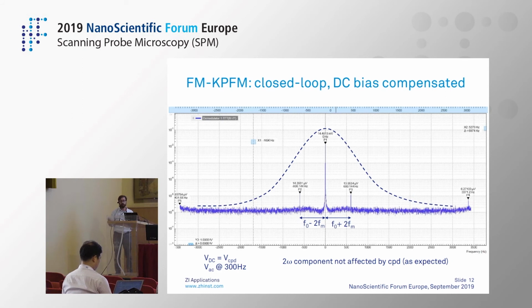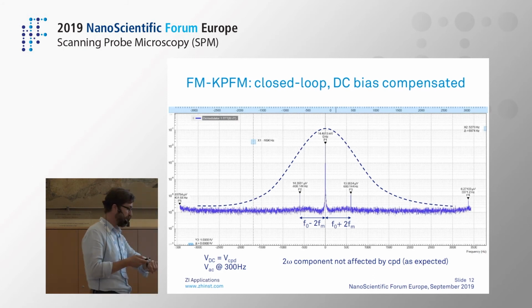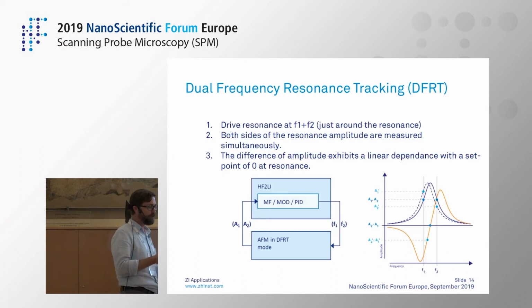But there are many variations. Of course you have AM Kelvin probe, which is also a non-resonant technique, and that's why for good resolution people tend to prefer FM. But in some cases it's quite slow because the modulation is quite slow, and that's why now people are moving towards either dissipation Kelvin probe, because you can actually modulate at the cantilever frequency if you project this electrostatic phase to the dissipation, or you can do some electrical pump probe to get time resolution. Yeah, but I'm not going to go too much into these details because I want to keep on schedule. Sorry.